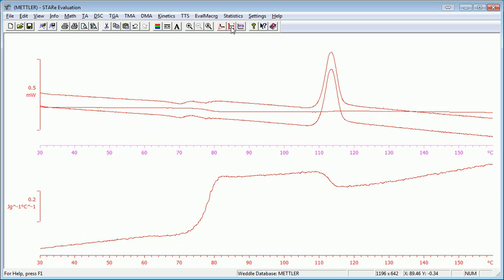So what this shows is an increase in heat capacity at the glass transition. And there's actually a slight decrease in heat capacity when the sample undergoes cold crystallization around 115 for PET.